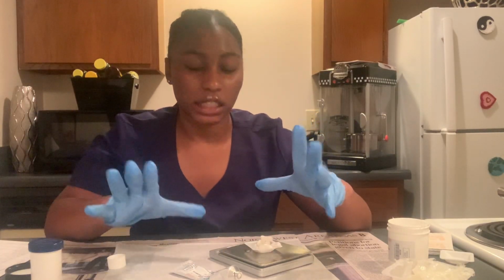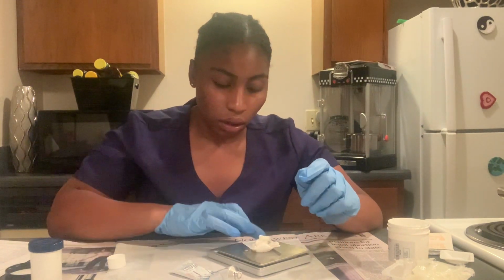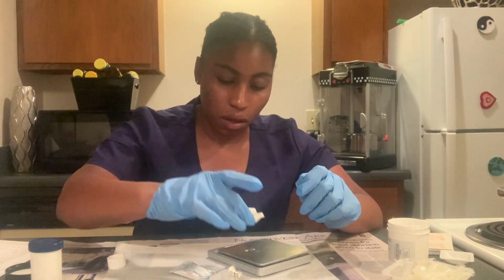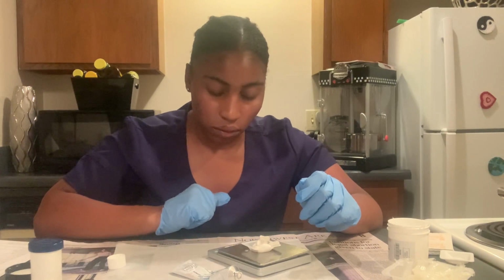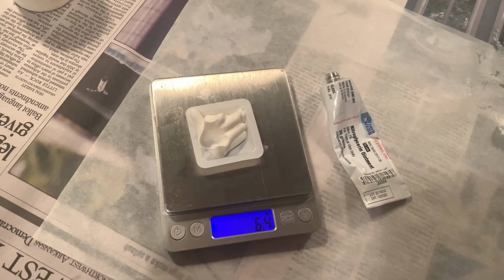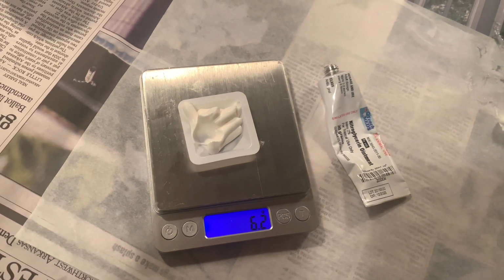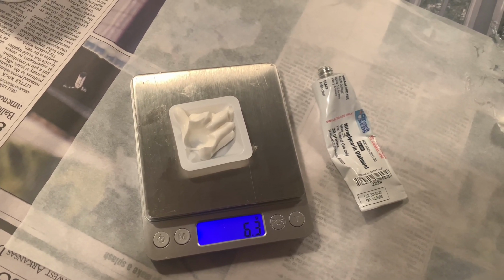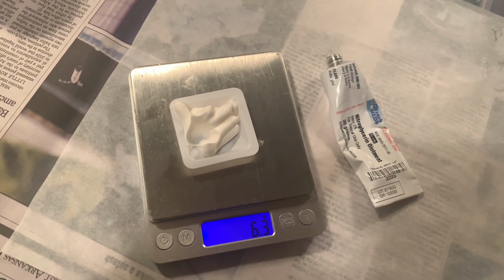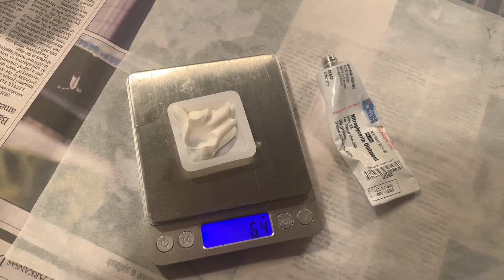Okay, so it's over just a little bit. So I'm gonna have to take some of it out. So this is the minimum and maximum weight allowed that you will need for the prescription. So this is what I have, and it keeps moving. I don't know why, but that's what I had. I had to take some of it out of there because it was way too much, like 7.0 something grams.